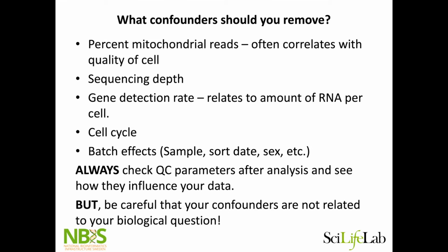And also think about it, I mean, if you remove cell cycle, for instance, and the whole study is about some differentiation process where cells go from cycling to non-cycling cells, you might actually remove the whole differentiation path by removing cell cycle. So it's not easy to really know what you should remove and what not.